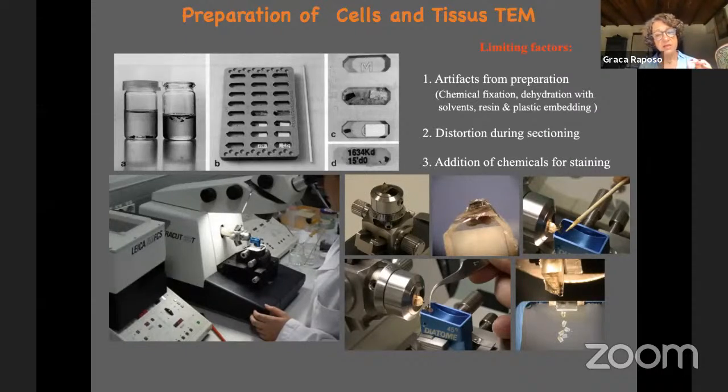You can see a little bit of the color. These are interference colors that you can look at on the loupe of the microtome. And you have these sections, and then you collect the sections with an electron microscopy grid, these small grids that are around 3 millimeters. Normally we use an eyelash to manipulate the sections.